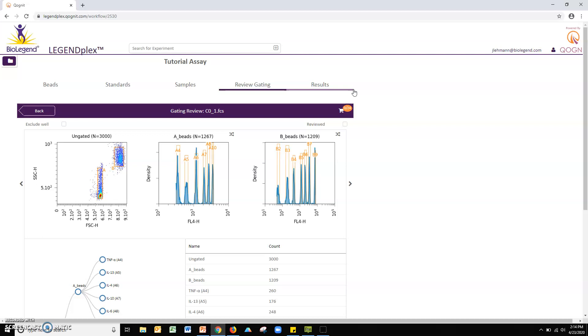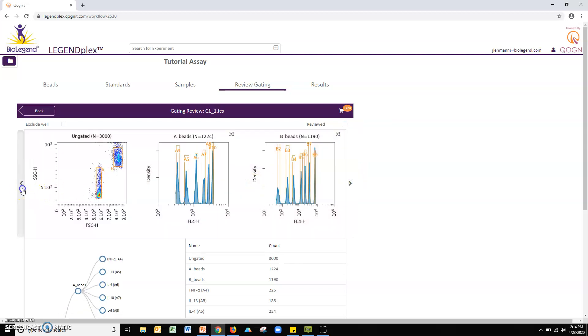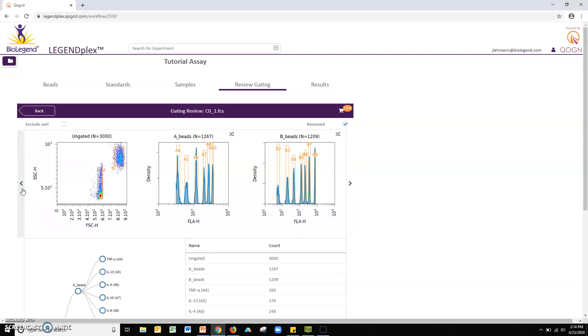Once you are satisfied with the gates, check the reviewed box to the upper right of the screen. The cart icon above the box will track the reviewed status of all uploaded files. Use the right and left cursor buttons found on the side of the plot images to scroll through and review all files, making any necessary adjustments. Once you are finished, click the results tab to remove to the quantitation results.